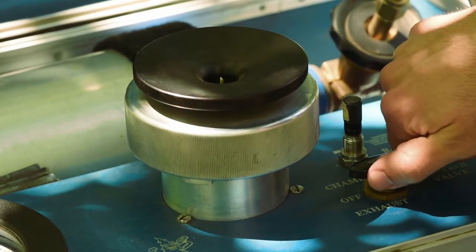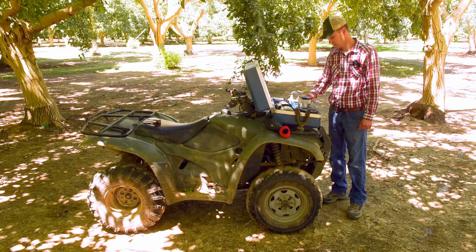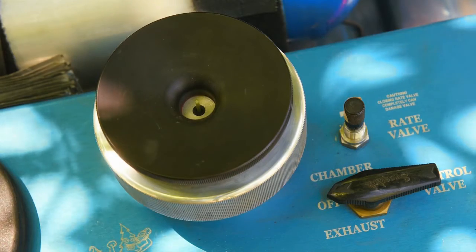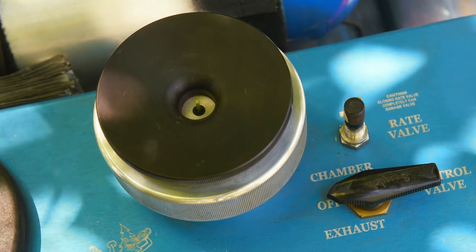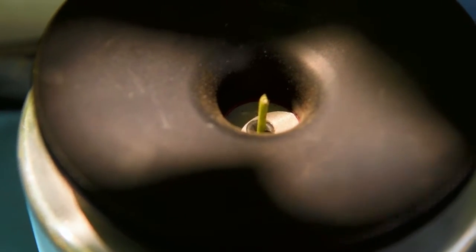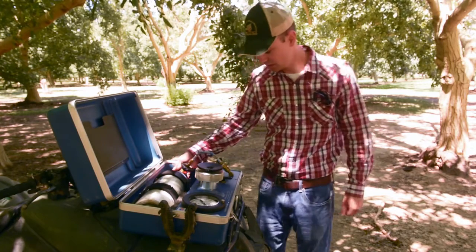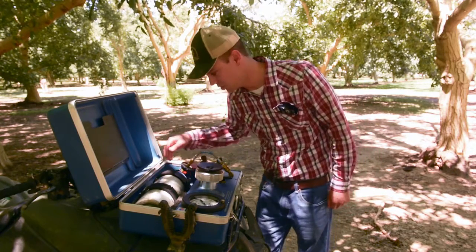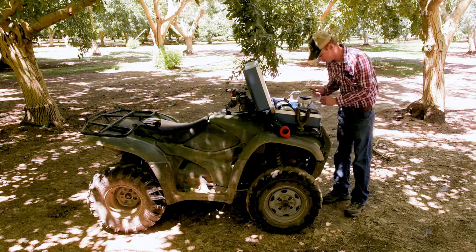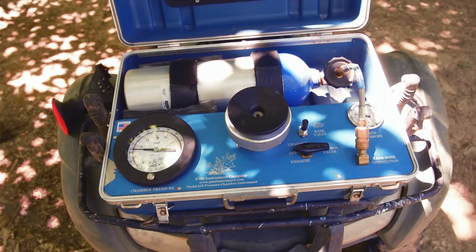And then we can pressurize the chamber. As the chamber is pressurizing, it will force moisture from the leaf up through the stem. So the sooner we see water at the stem, the more hydration we know that's in the leaf. So we just observe that — usually you can use a magnifying glass or something like that — and you just wait for that moisture to appear there.